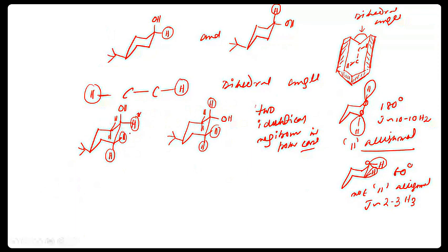So here equatorial means it's equatorial with these, axial with these. Here we have equatorial and axial coupling.